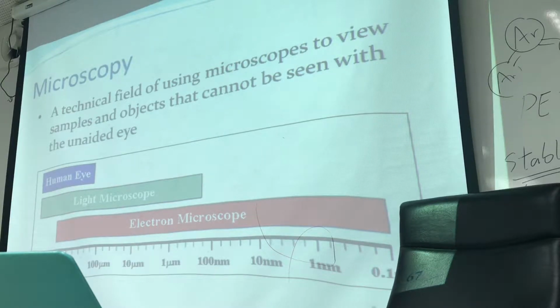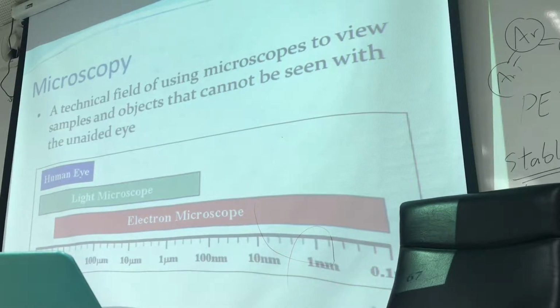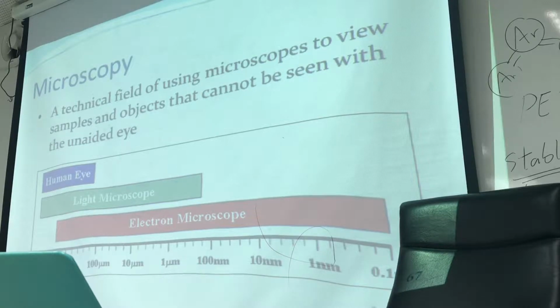It's quite simple and easy to operate. And the way that you prepare the sample is actually not that hard, alright? But you need to do 3 steps. Remember what they are. First is grinding. Second is polishing. And the third is etching. Alright? So you can see the grains in the optical microscope.